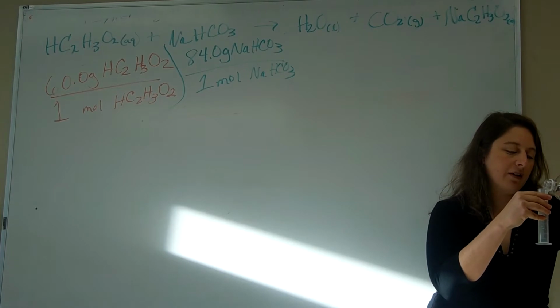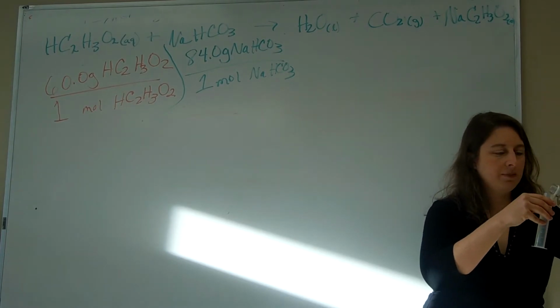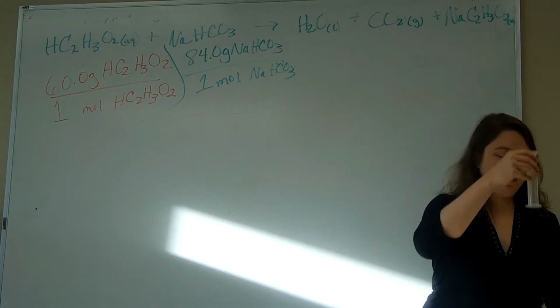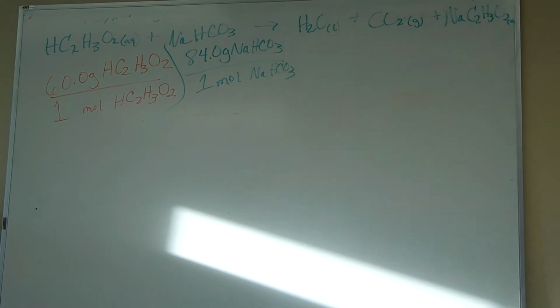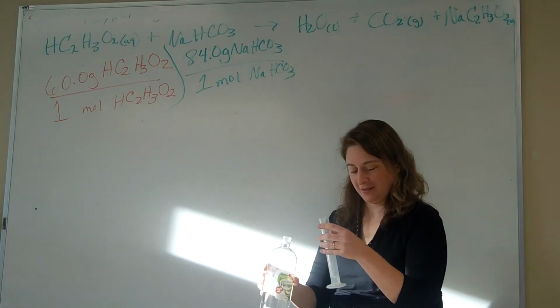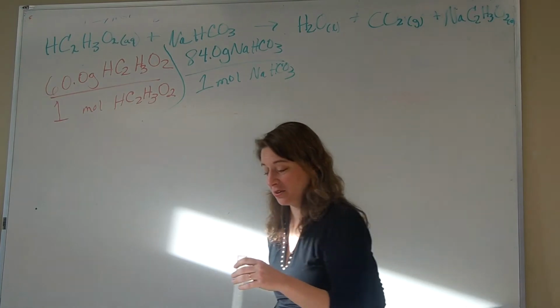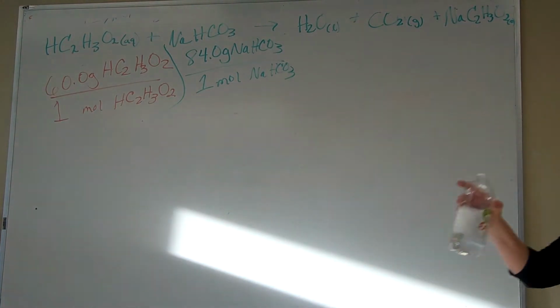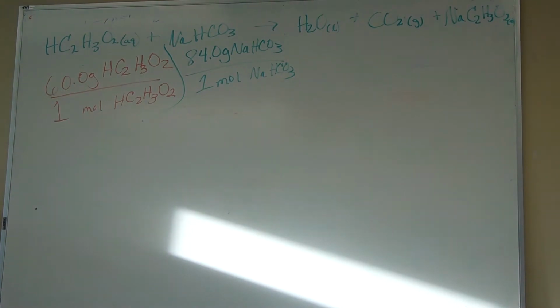Just forget ours, that looks contaminated. Awesome. I might want to write that down for Eric. You can just rinse it out. It's always better to clean your, oh, I know what that is too. Oh no. Okay, let's see what happens. Boom. What is it? I'm going to let that soak for a little while, and you guys can just use mine.